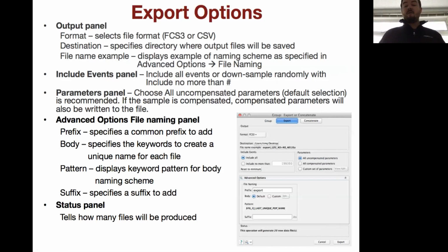There are 2 different CSV output options. One is scale and the other is channel values. Scale values correspond to the fluorescence detected in your cytometer, and so typically that's the format you would want to use. Sometimes people will want to see the data after it's been binned in FlowJo, in which case you would want to use the channel format, but that's much less common.